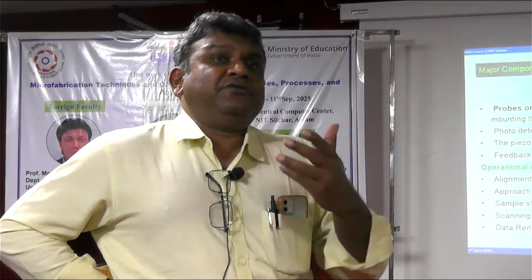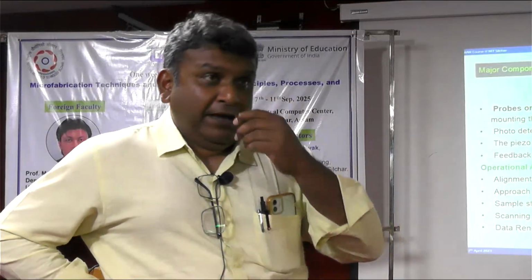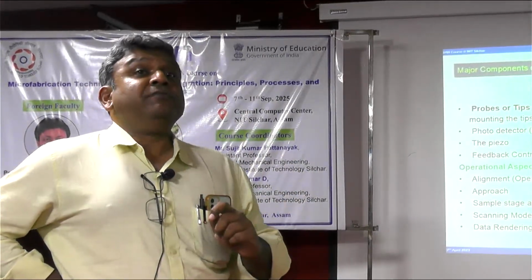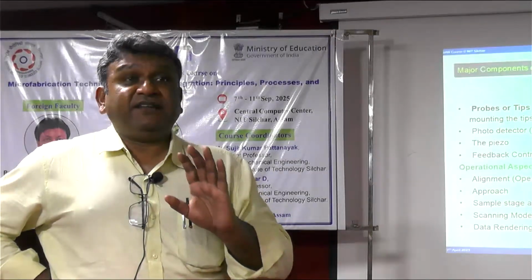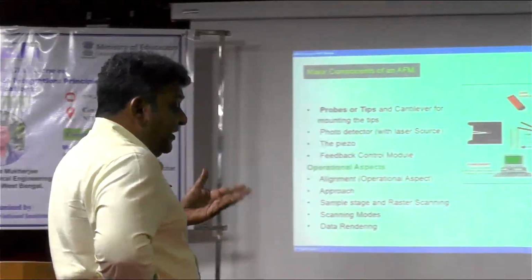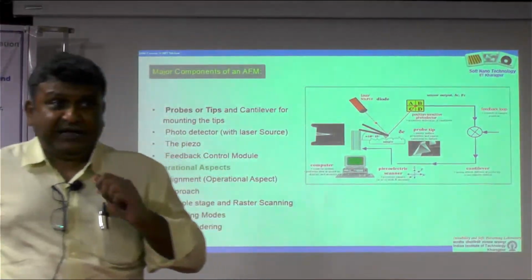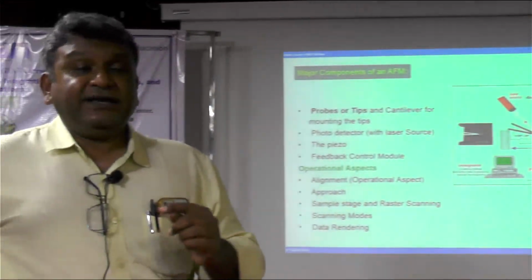The magnitude of tunneling current is very low, so you go for a picoammeter. However, what meter is going to measure the van der Waals force? Turns out there is no such instrument available. So some optical arrangements were made to track the change in this force, and that is what I am going to teach you in the next few minutes.